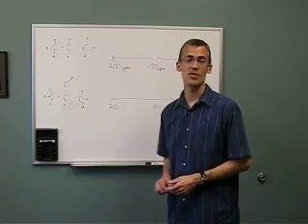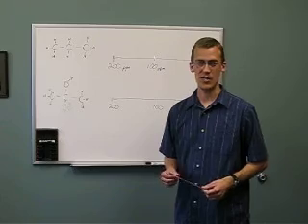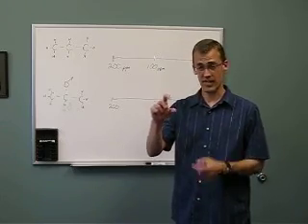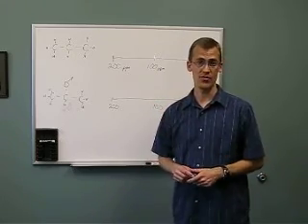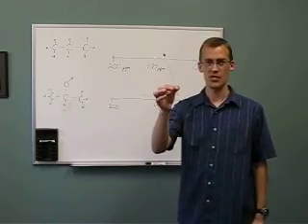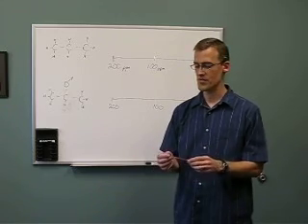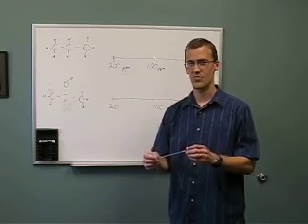In the NMR, we happen to use the radio frequency range of the electromagnetic spectrum. And instead of little square cuvettes or test tubes, we'll use glass tubes that look like this. And the shape is somewhat useful. I mean, there's a reason for it.